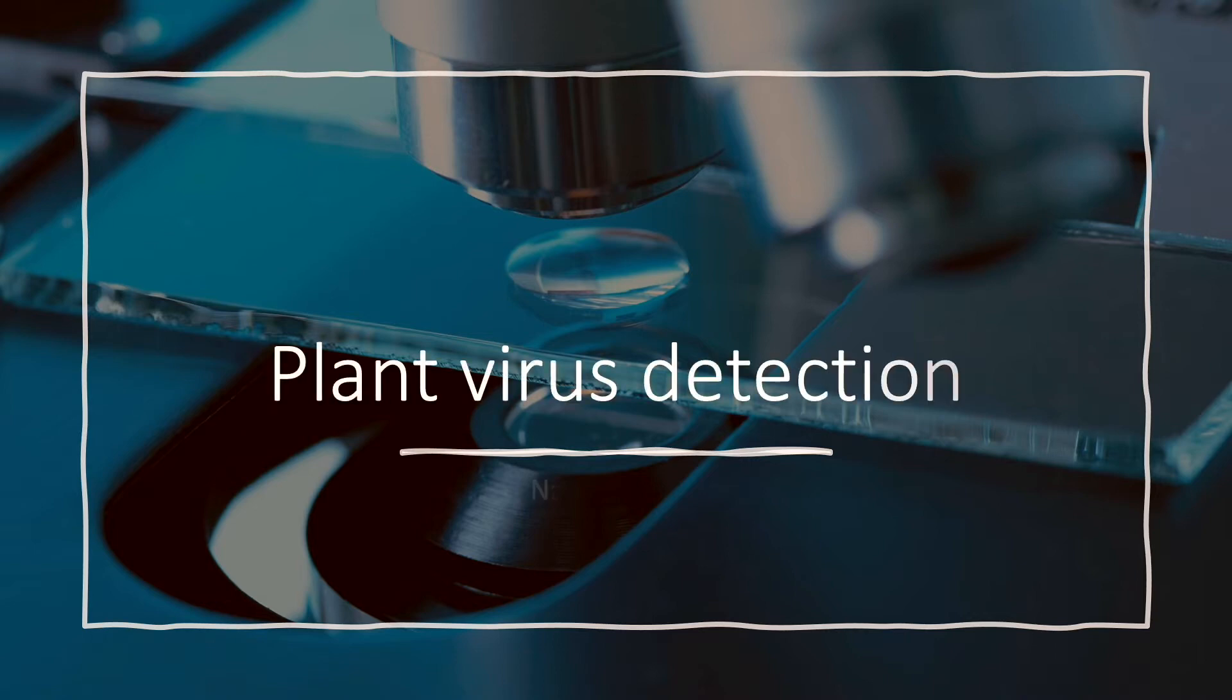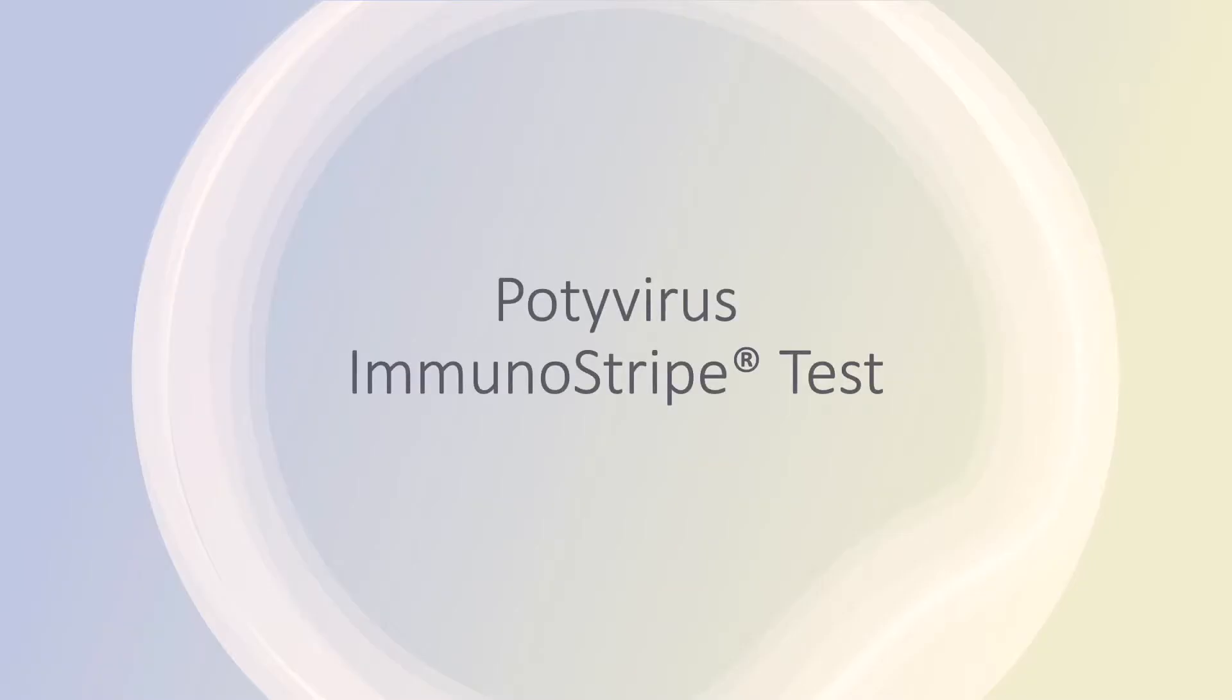Hello everyone, today I am going to show you a rapid method of plant virus detection, the potivirus immunostripe test.